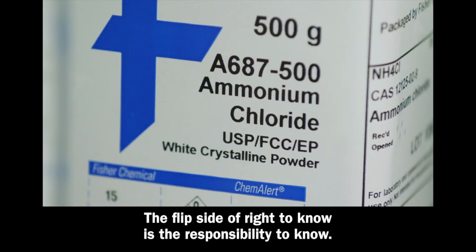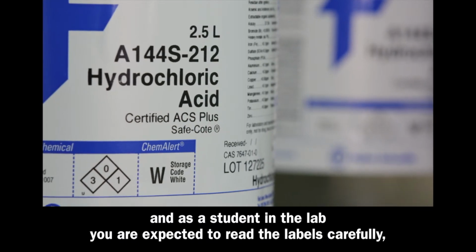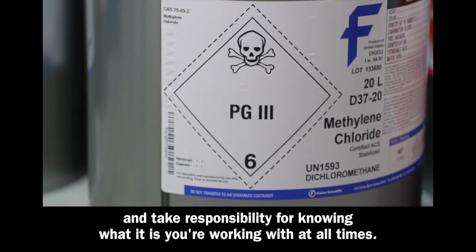Students should not label a container unless the act of labeling a container is specifically part of the experiment. The flip side of right to know is the responsibility to know. And as a student in the lab, you are expected to read the labels carefully and take responsibility for knowing what it is you're working with at all times.